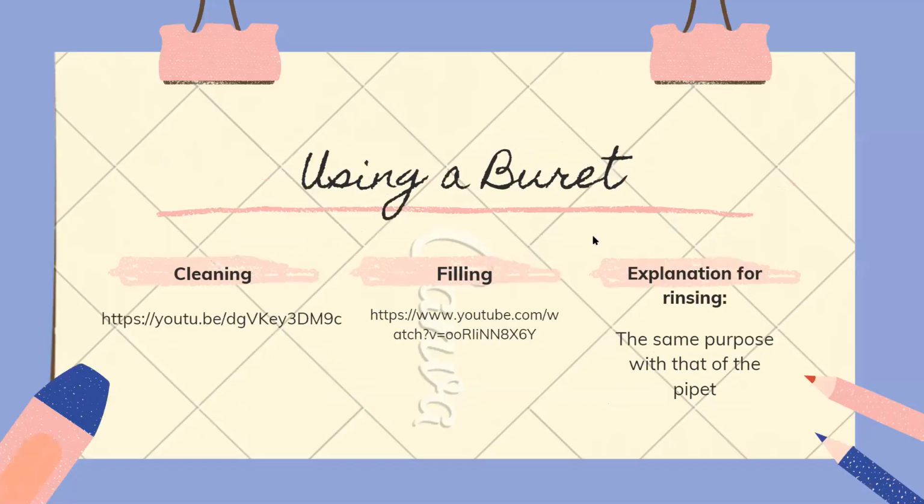Okay, sige. So how about using a burette? I will not dwell also more with the cleaning and the filling. You may always watch the videos, the sample videos sa YouTube. So I have provided the link. Now sa explanation gihapon sa rinsing, that's the same purpose with that of the pipette.